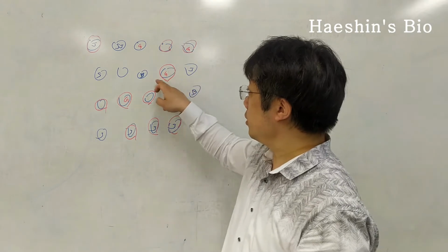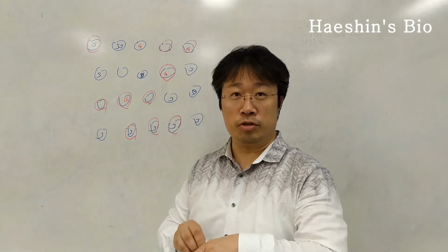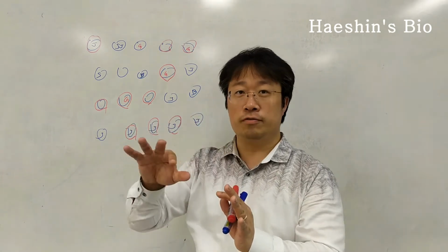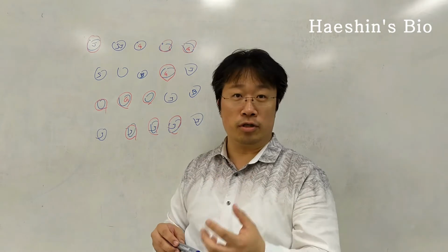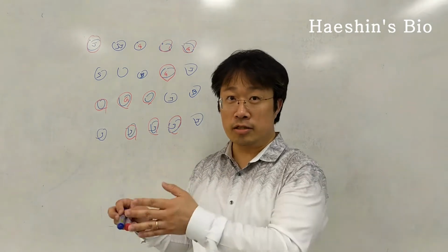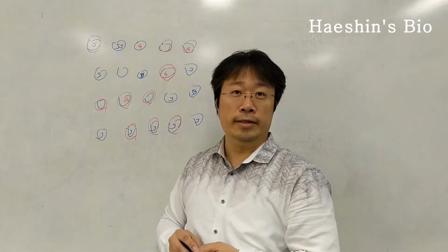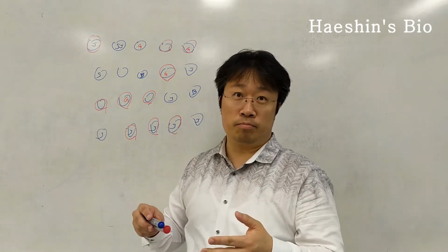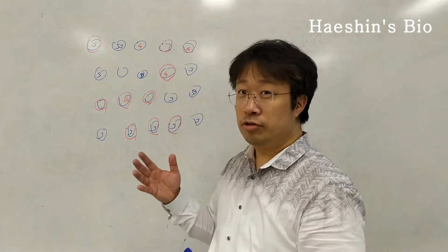If these people represent individual proteins, which have different charge, different size, and different shape, they all have different appearances in the case of proteins. The human case is the same: our individual students have different appearances.